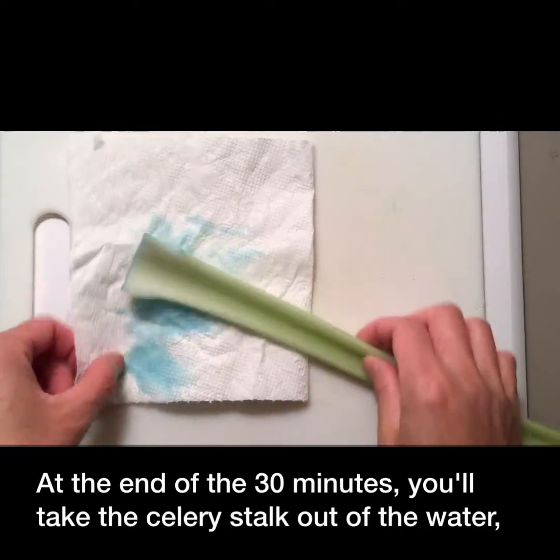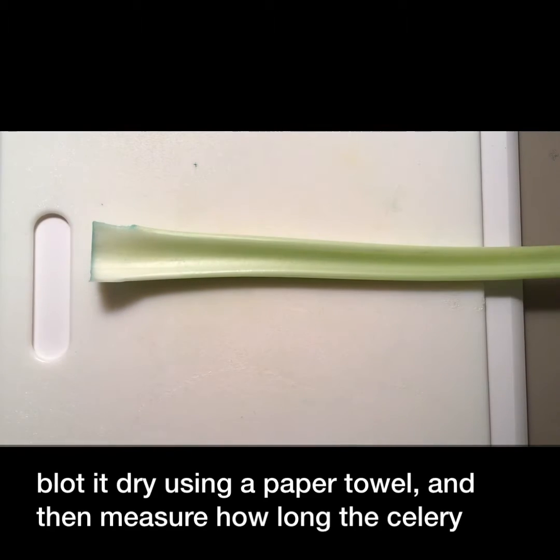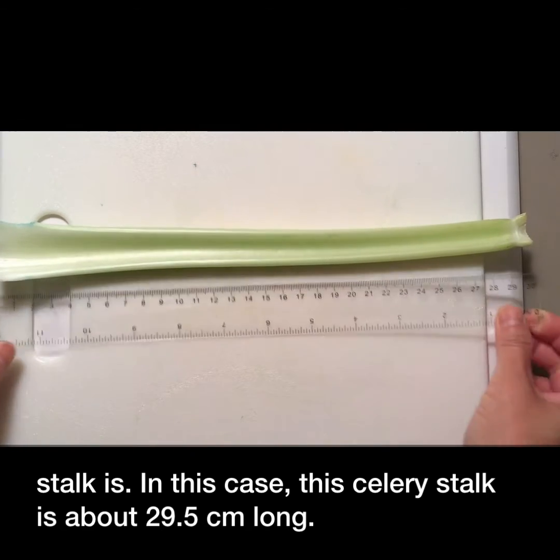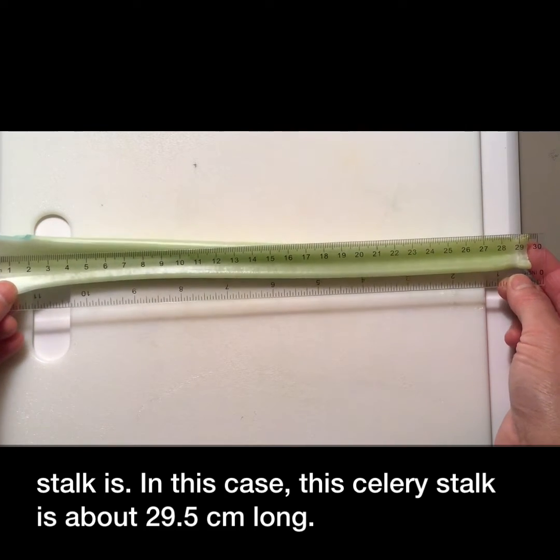At the end of the 30 minutes, you'll take the celery stalk out of the water, blot it dry using a paper towel, and then measure how long the celery stalk is. In this case, this celery stalk is about 29.5 centimeters long.